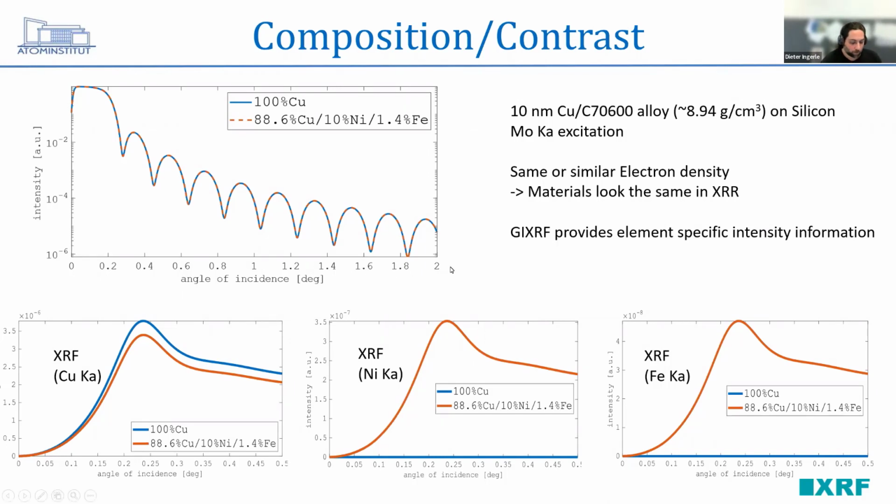Yeah, exactly. One sample we had recently: maybe you have some hafnium silicon oxide or something like that, and you wonder how much silicon is in your hafnium silicon oxide. If it's basically the composition you want, then you can also look at the different concentrations with the fluorescence, which is quite helpful.